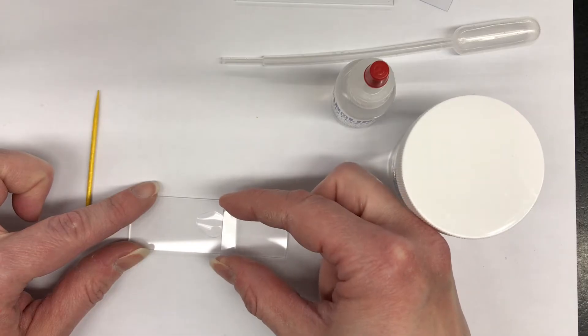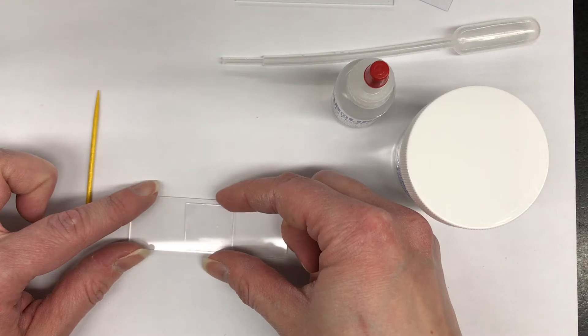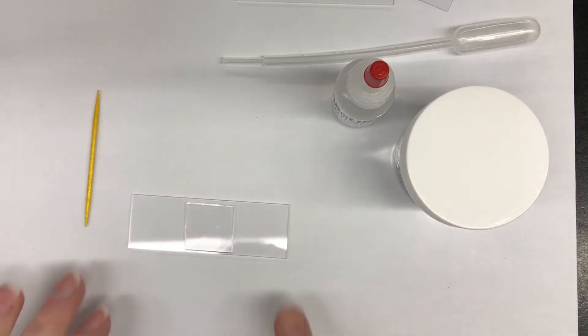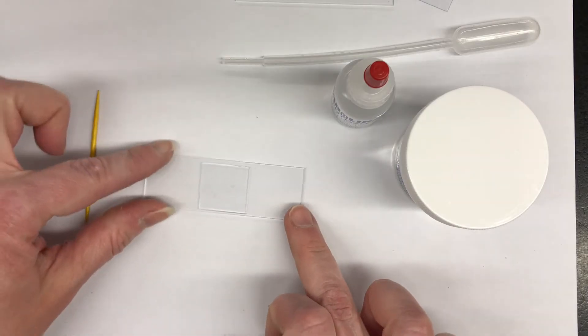You're going to place the cover slip on the glass slide. One edge of it is going to be on the glass slide, and you're going to slowly lower it down onto your slide. So that is our amoeba specimen slide.